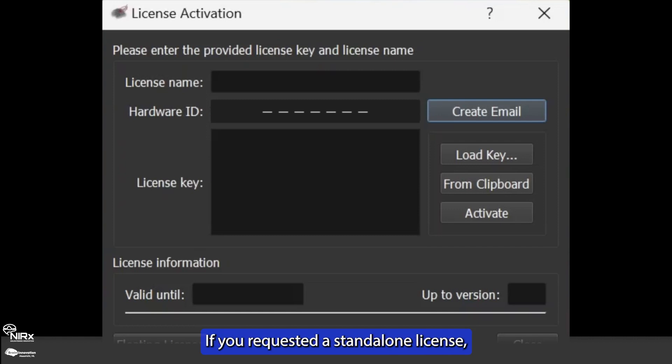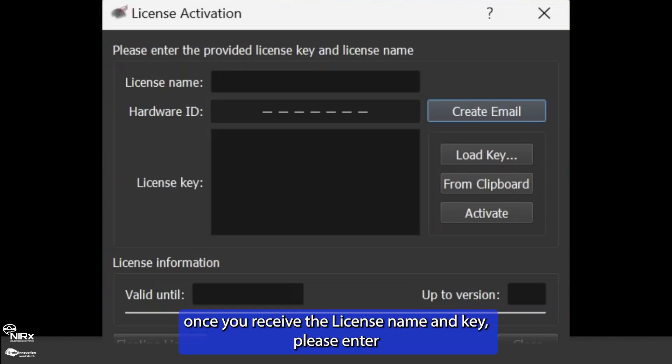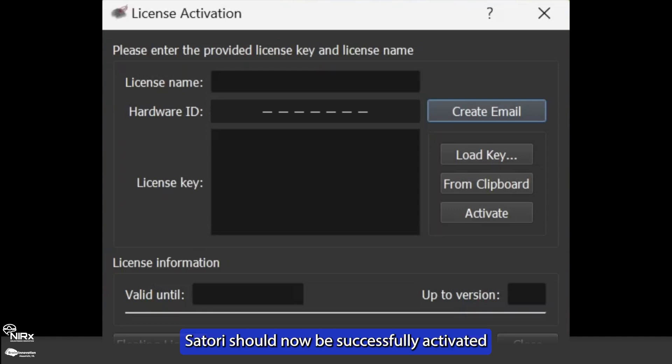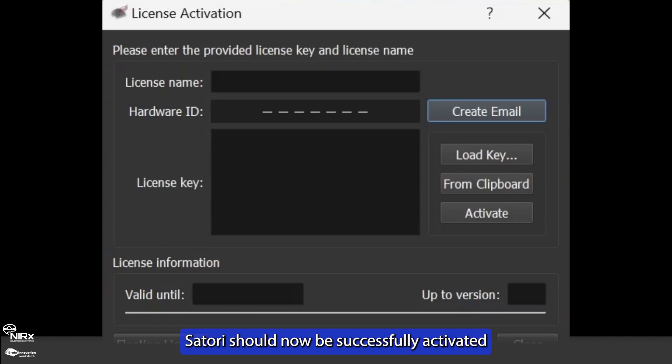If you requested a standalone license, once you receive the license name and key, please enter the license details in the dialog and press activate. Satori should now be successfully activated and after closing the dialog, you can now start Satori.